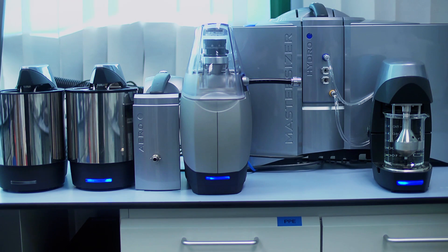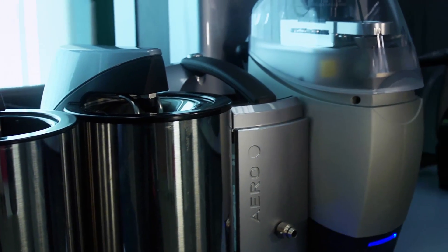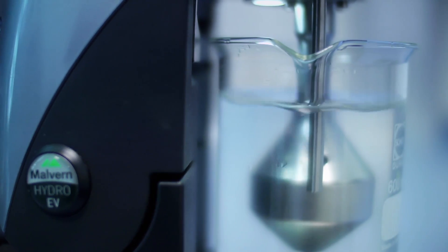Reproducible and reliable particle dispersion is ensured by a wide range of sample dispersion units, which enable the measurement of dry powders, suspensions, and emulsions.